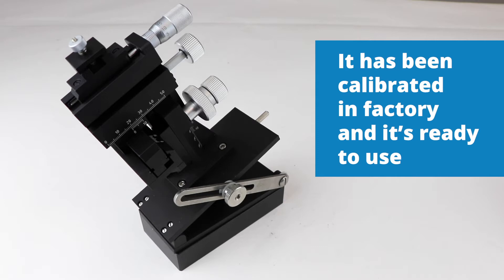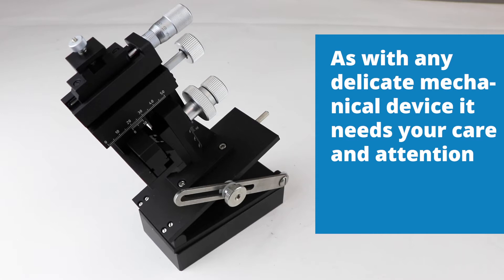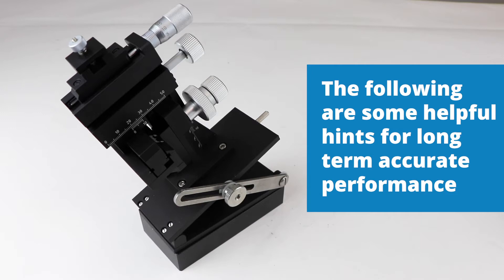Your micro manipulator is a precision instrument. It has been calibrated at the factory and is ready to use. As with any delicate mechanical device, it needs your care and attention for long-term accurate performance.